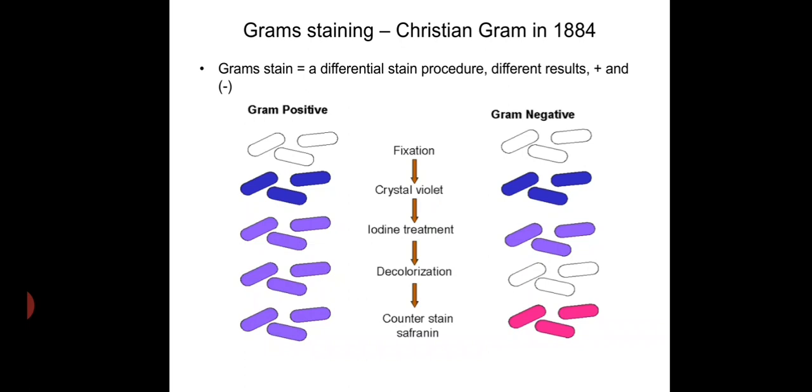In a bacterial colony, we apply the Gram staining procedure. The bacterial members are sorted out into Gram positive bacteria and Gram negative bacteria. After analyzing the characteristics of the bacteria, it is decided which antibiotic will work.